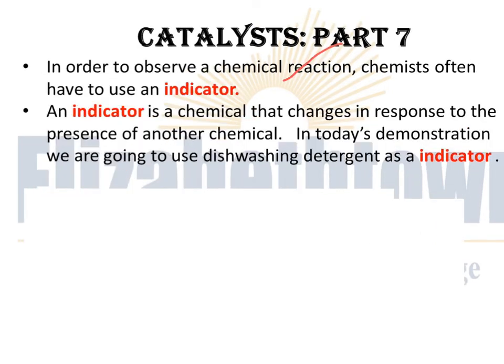Now, oxygen is a gas, and it's a clear gas, and it's odorless. So it's kind of hard for us to tell when it's there. So we're going to have to add an indicator to this experiment. The indicator we're going to use is dishwashing detergent. Dishwashing detergent responds to the presence of a gas. How does it respond? By blowing bubbles, right? So that's going to serve as our indicator in today's lab.